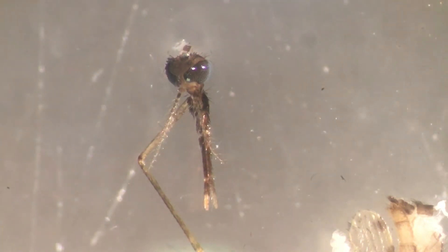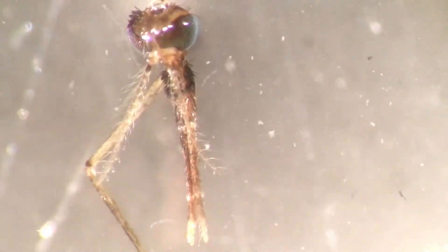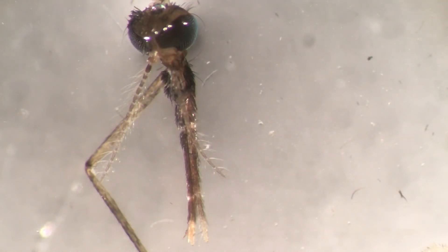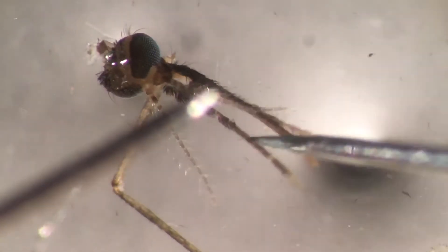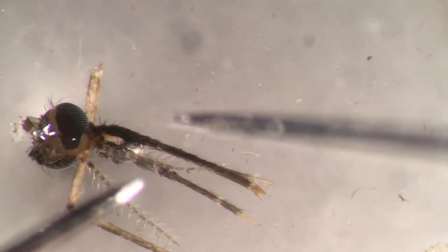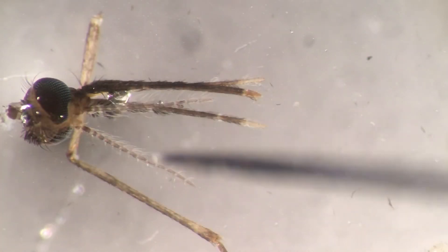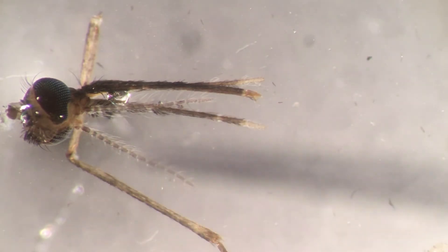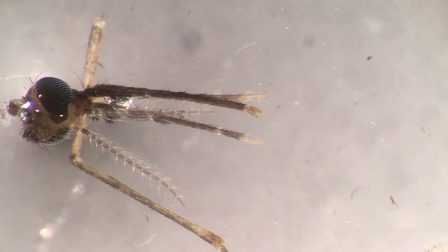Maybe we should have a quick look at the mosquito head. There we go - we get less glare without the light. You need to be careful because this is very tiny. So we have these things called palps - P-A-L-P-S - which are quite long. And this is the antenna. In males, the antennae are quite massive.